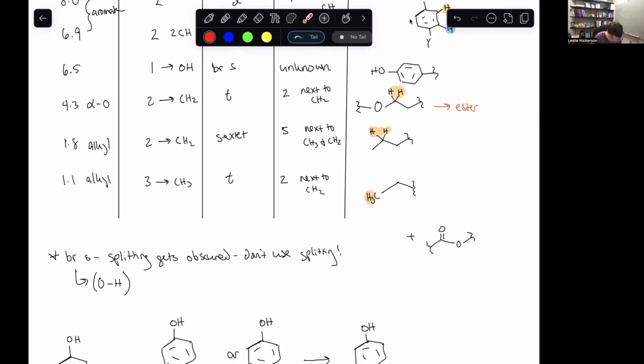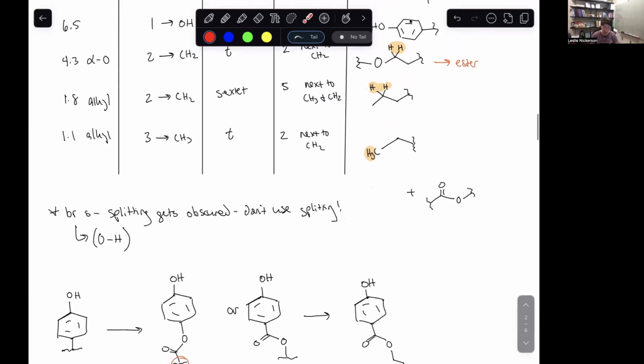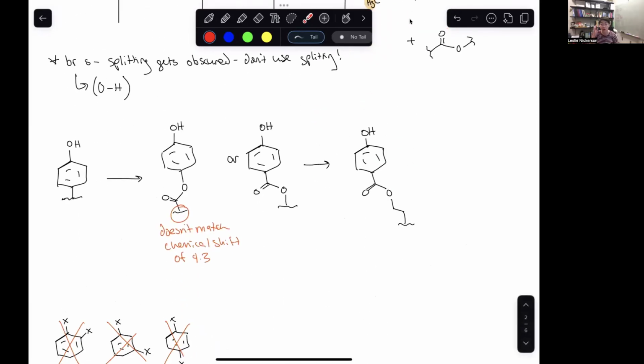And then we're coming down to our last two alkyl pieces. What we want to be thinking about here is we're at the stage where we really need to be counting things up and seeing where we're at in terms of our formula. So I should have 10 carbons here. So 6, 7, 8, 9, 10.